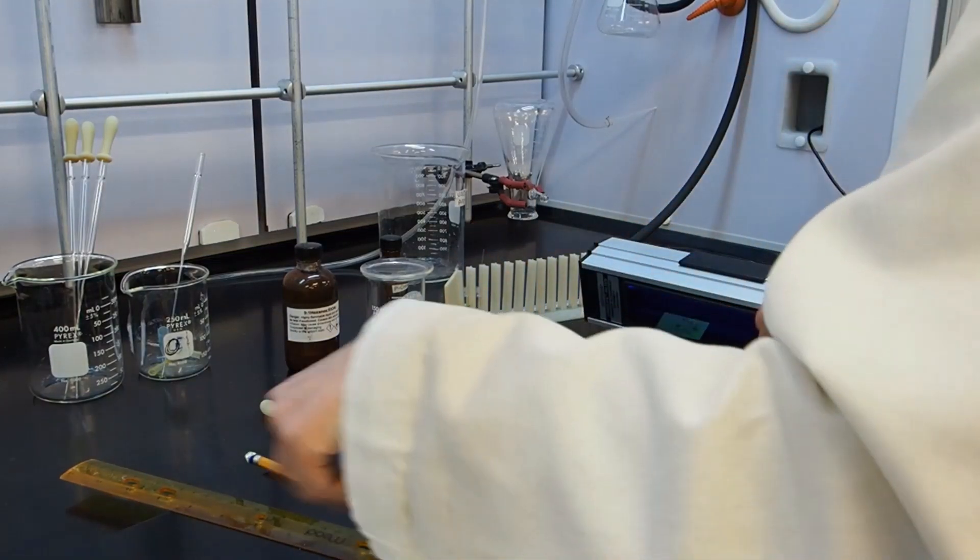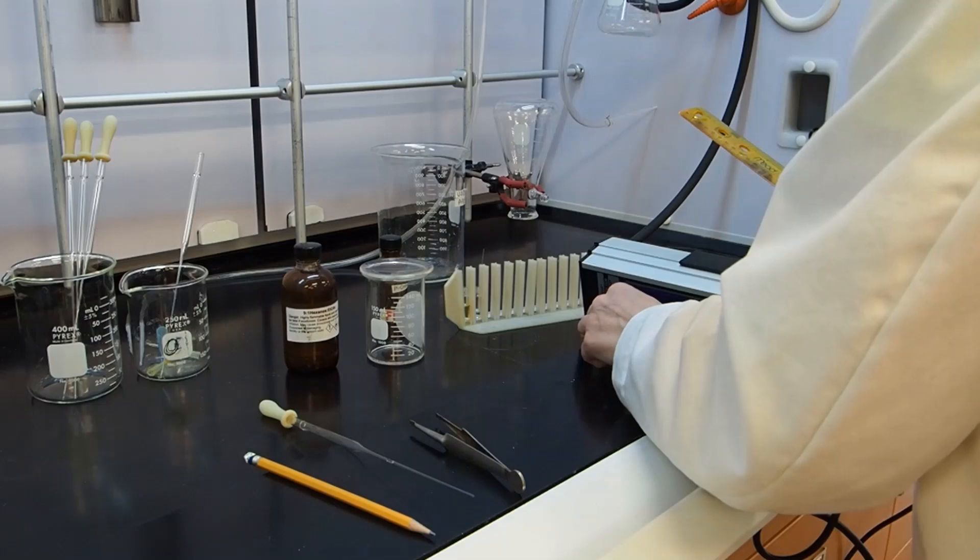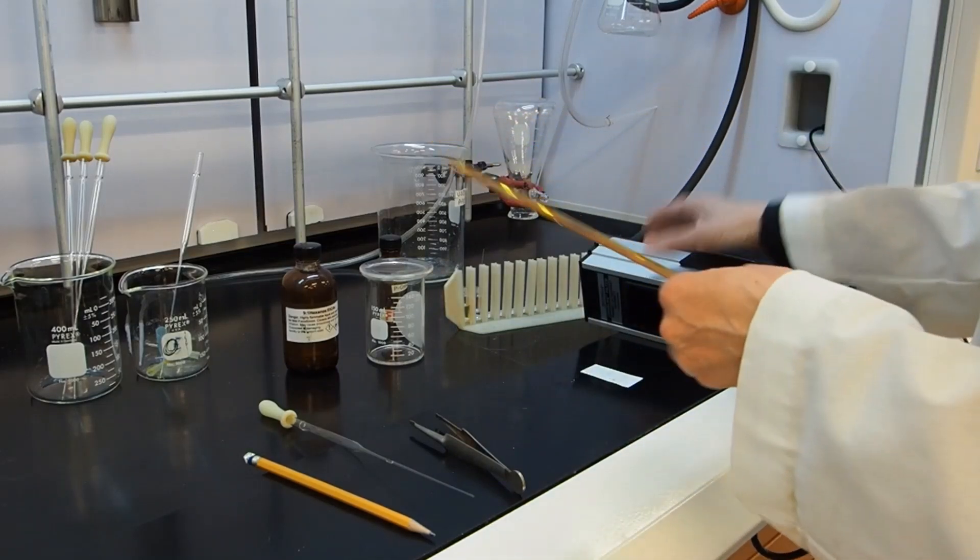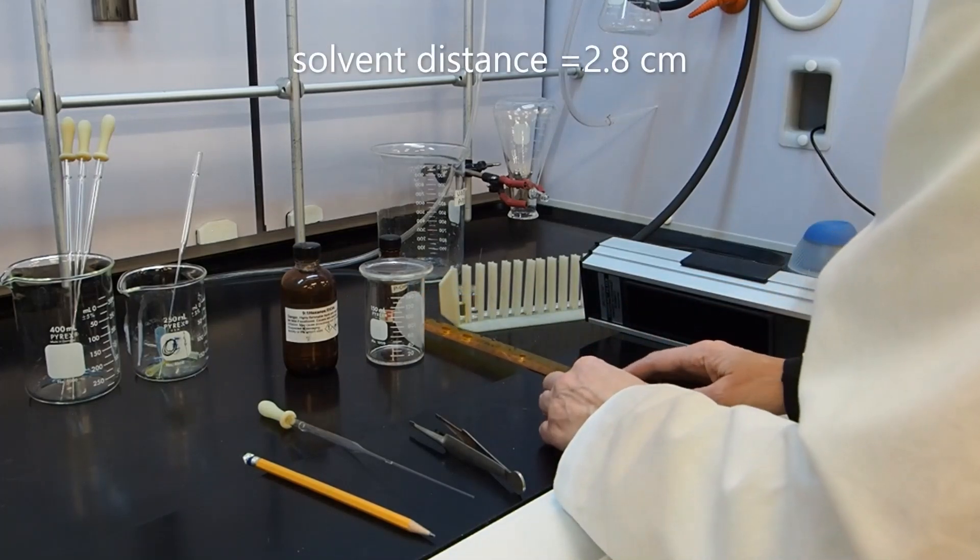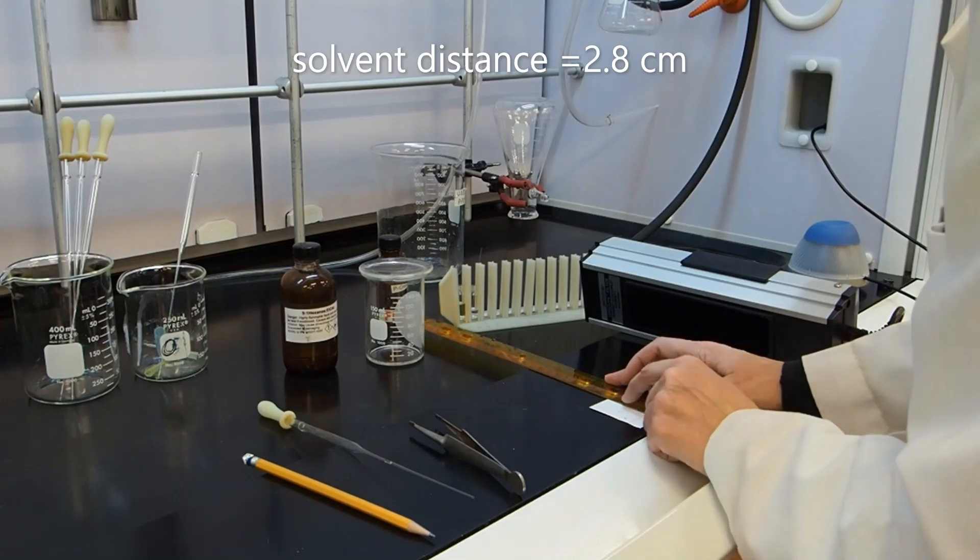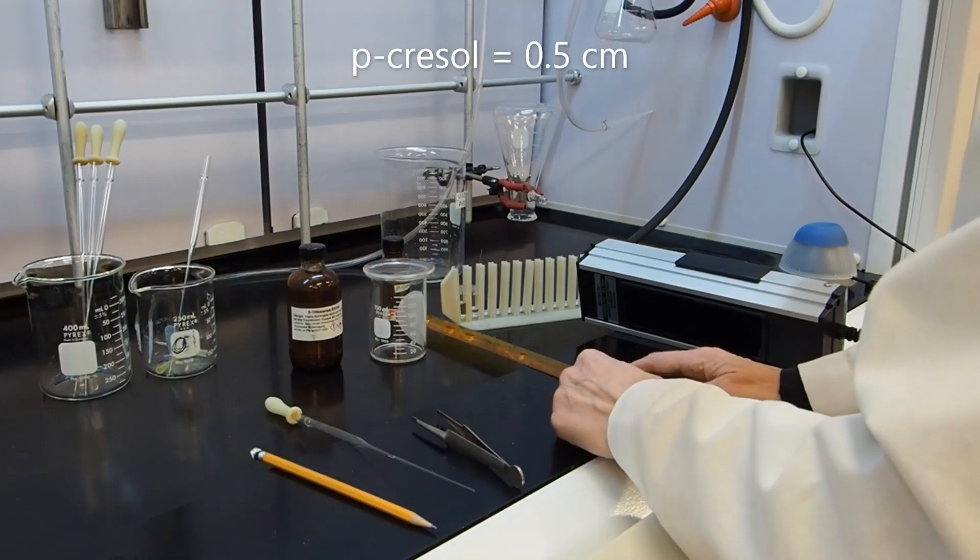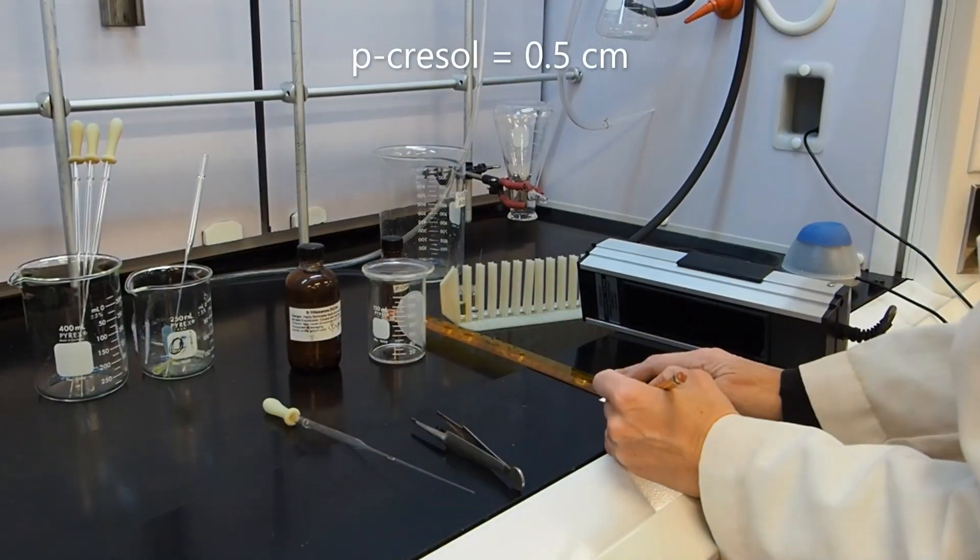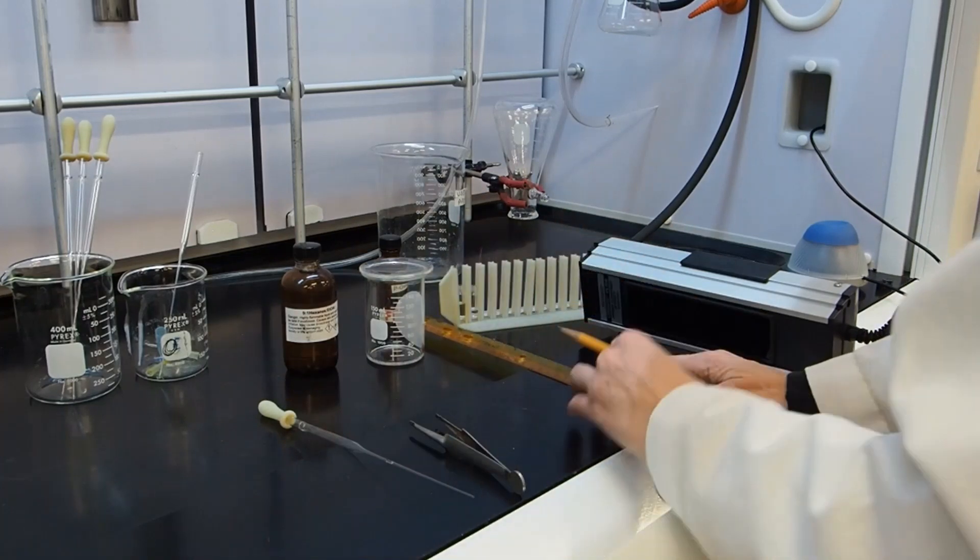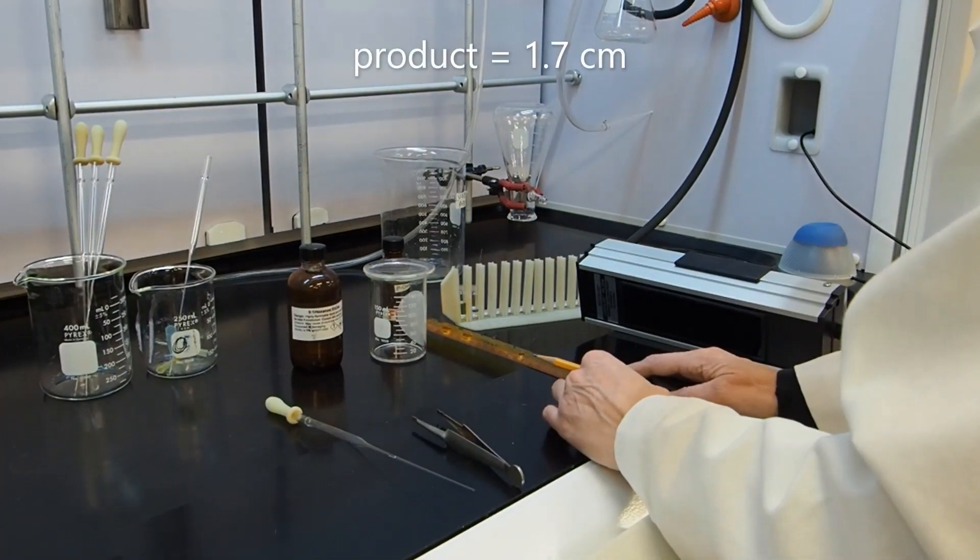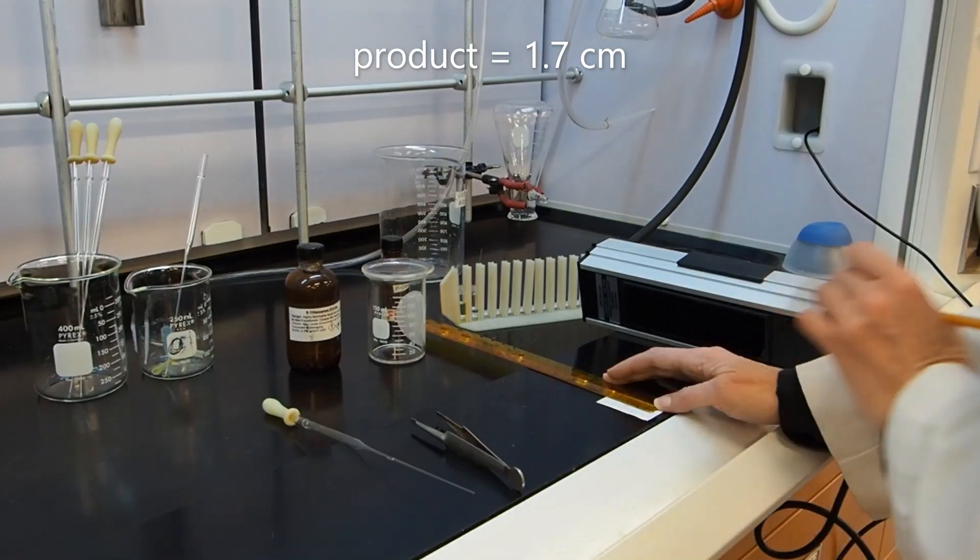I'm going to go ahead and measure the RFs. I'm going to measure them in centimeters, and I no longer need my light, so I'm going to turn it off. Measuring from the starting line to the solvent finish line, that looks like about 2.8 centimeters. Measuring from the starting line to the middle of the cresol spot, that's about 0.5 centimeters. And from the starting line to the middle of what I hope is my product spot, it's about 1.7 centimeters.